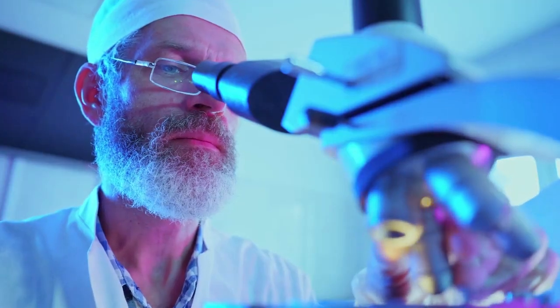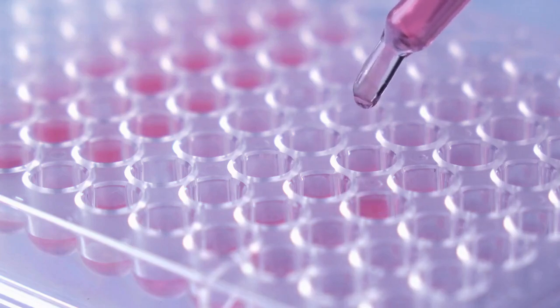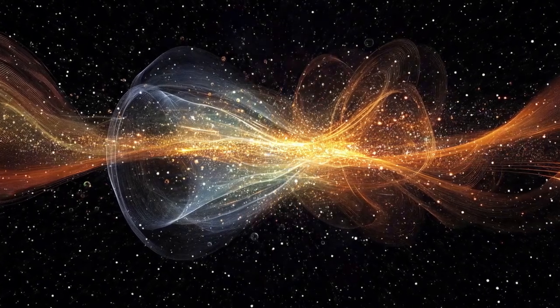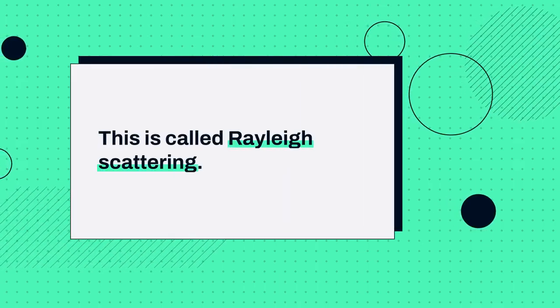Let's start with Raman spectroscopy. Imagine you shine a light on a molecule. This light is made of tiny energy packets called photons. Most of these photons will bounce off the molecule with the exact same energy they started with. This is called Rayleigh scattering.